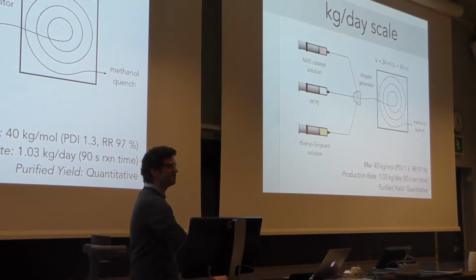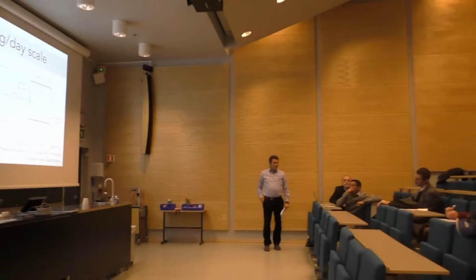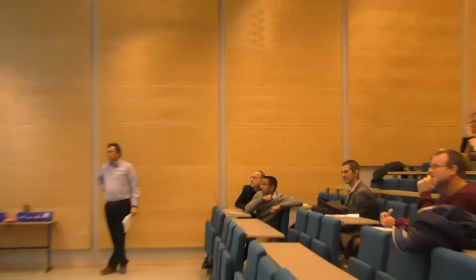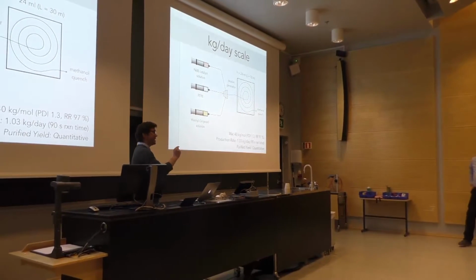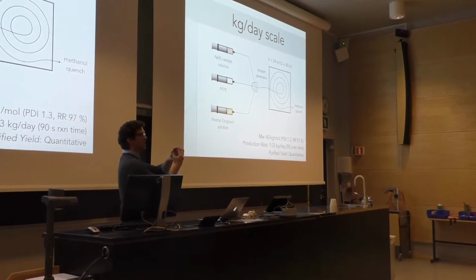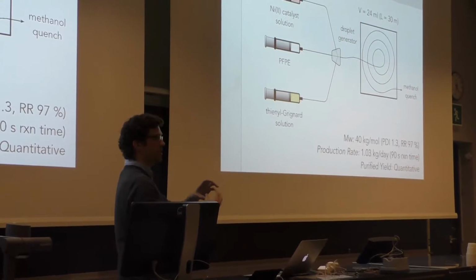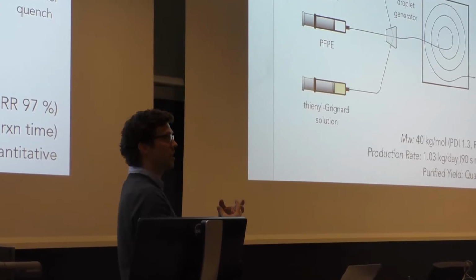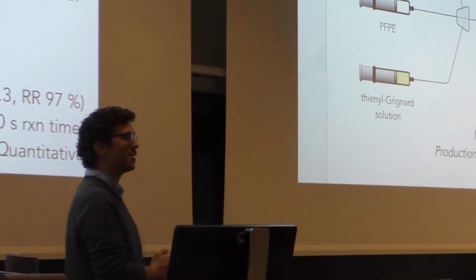Very nice, James. Have you guys ever tried, I can't imagine it working with conjugated polymers yet, but trying to use your carrier oil to have stuff in it, so you're doing heterogeneous catalysis, which you can imagine recycling, so your catalyst forever lives in the other phase, and you filter not just your goodies. So the initial method, before we came up with the soluble nickel catalyst, was to put the nickel chloride version of that catalyst in the oil, and then that would diffuse into the droplet. We have done other work, not with polymers, where we have loaded the carrier oil with solids, so bases and things like that, exactly that. We haven't done the recycling bit though.